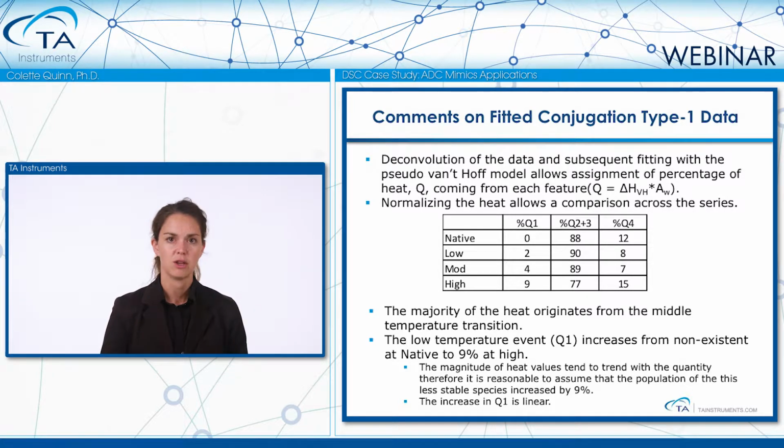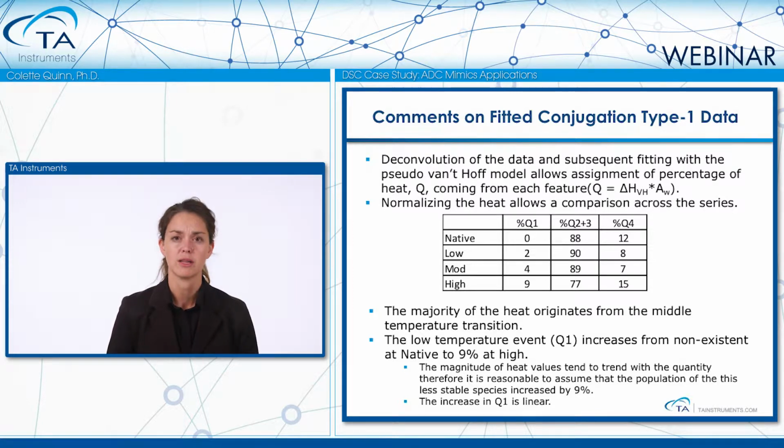And also the increase in the Q1 is linear. So it looks like how they're going on is in a similar fashion, in that it's the same species, and we just have more and more of that same species growing as we add more and more of the drug.